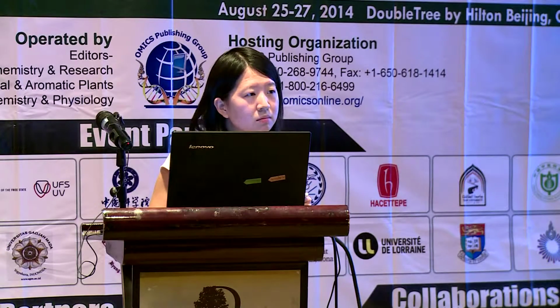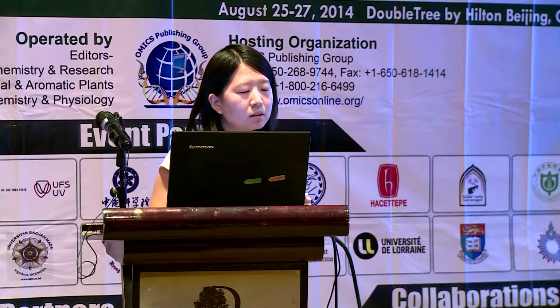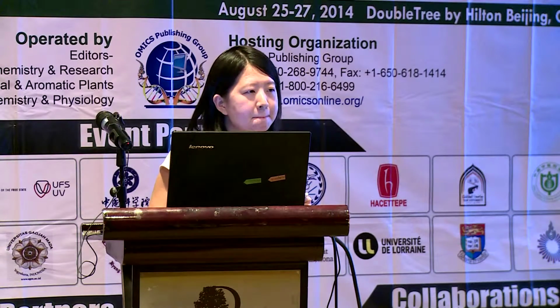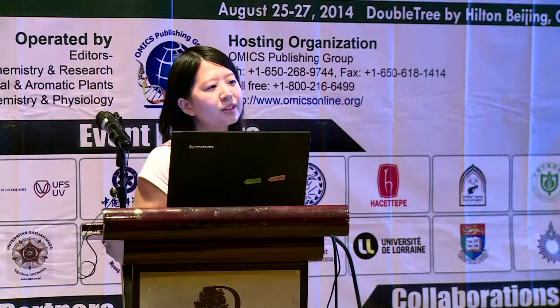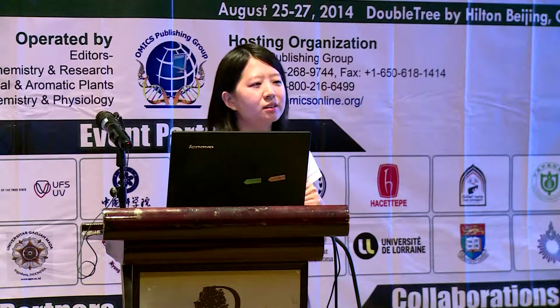These alkaloids decompose easily, so high temperature, right? Yeah. And probably, did you find the molecular weight in your GC-MS? The molecular ion peak? Yeah, I can find. Not all of them. Like for lycorine, not the base peak, just the big peak is usually 109.